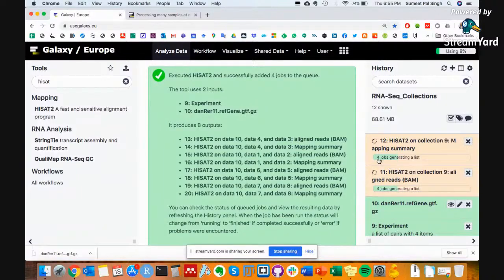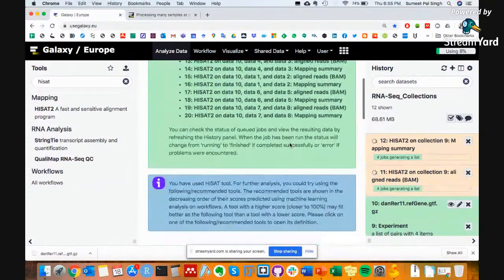And everything runs together. And once you have run this one time, then just save it as a workflow. And then for every other experiment that you do, you can do this. Get an email when it's finished, and it's super automated, super quick, and really nice, helpful.